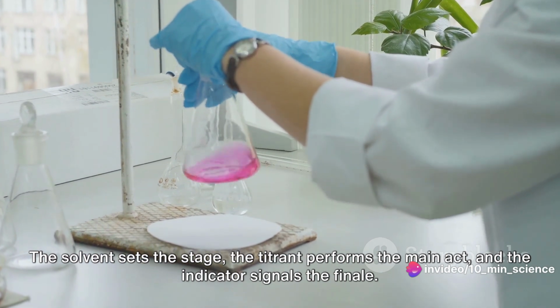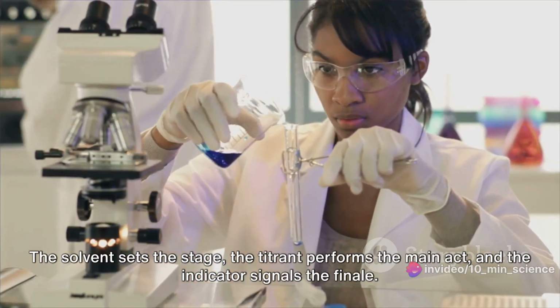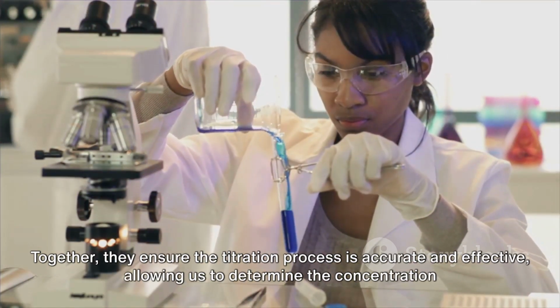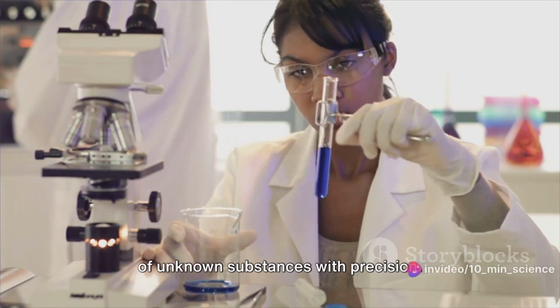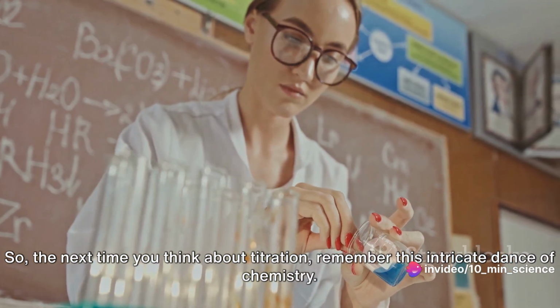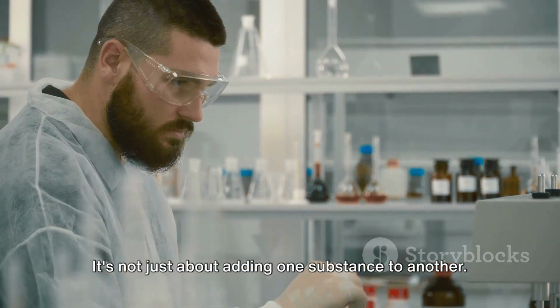Each of these components, the solvent, the titrant, and the indicator, has a pivotal role to play. The solvent sets the stage, the titrant performs the main act, and the indicator signals the finale. Together, they ensure the titration process is accurate and effective, allowing us to determine the concentration of unknown substances with precision.